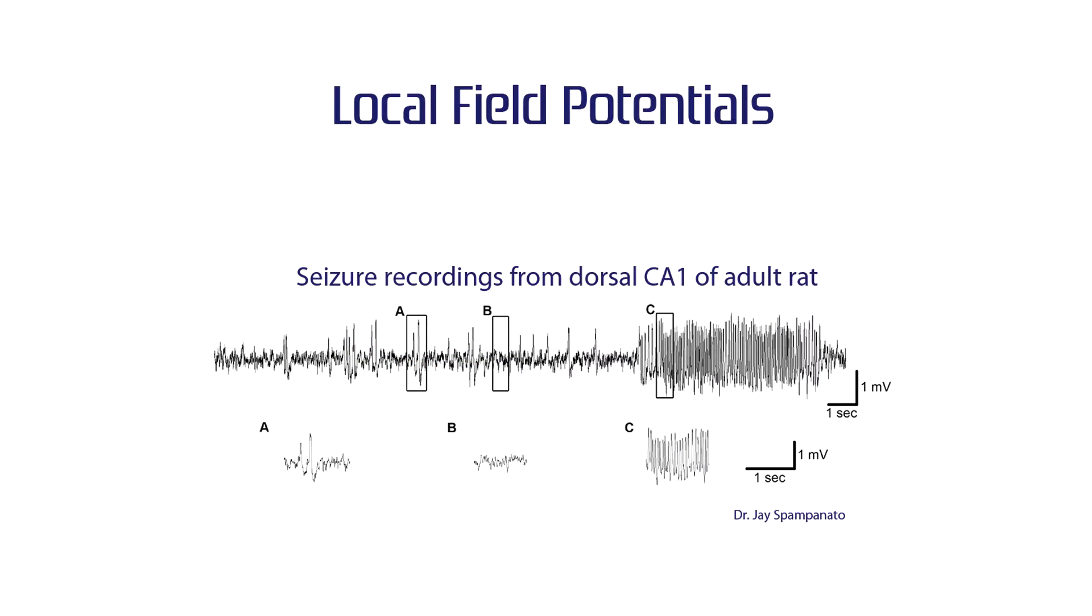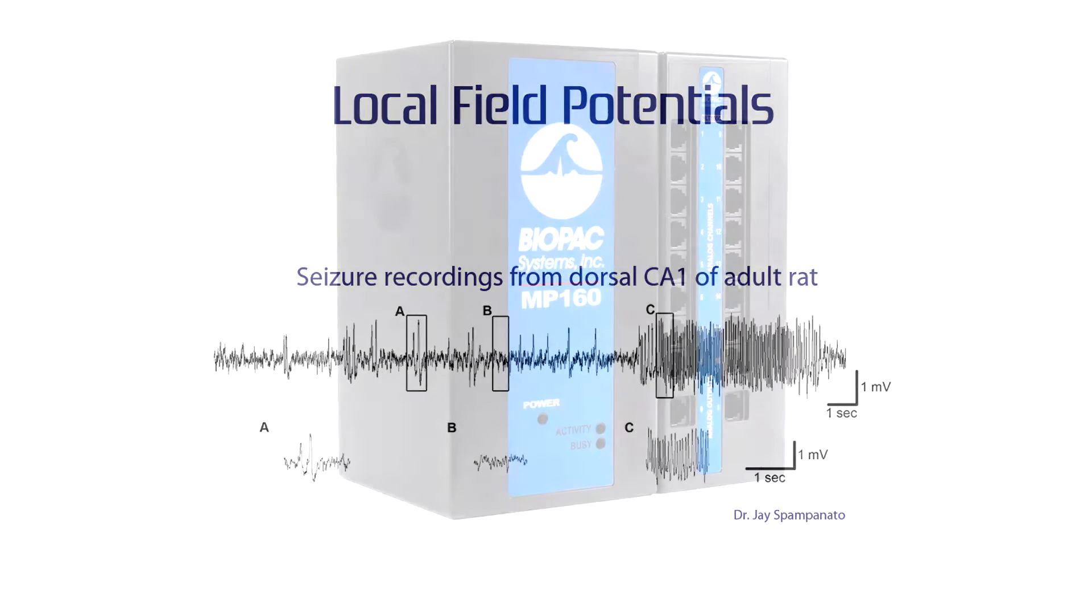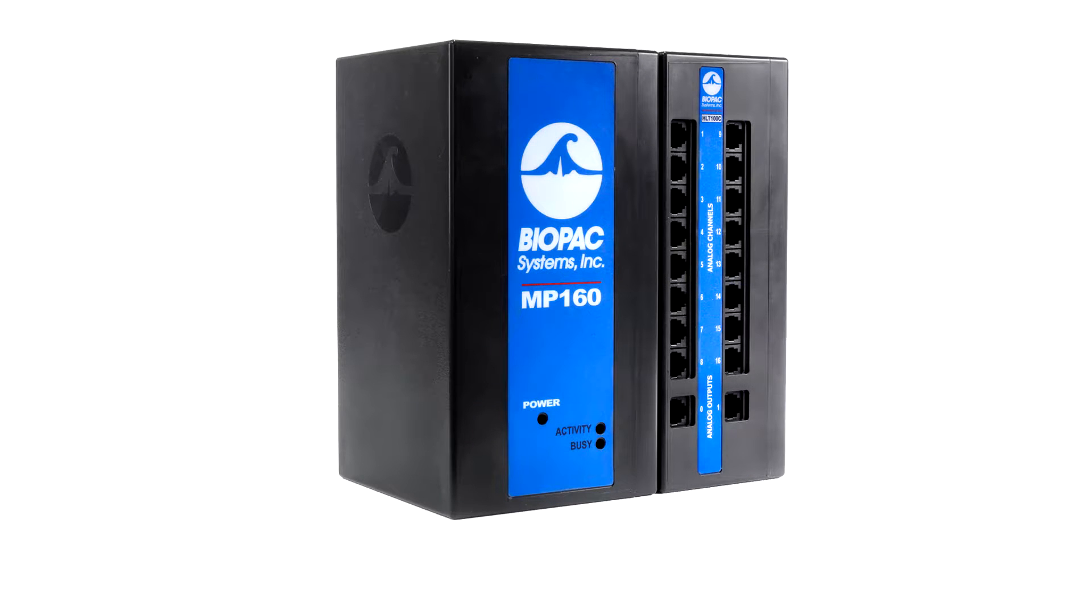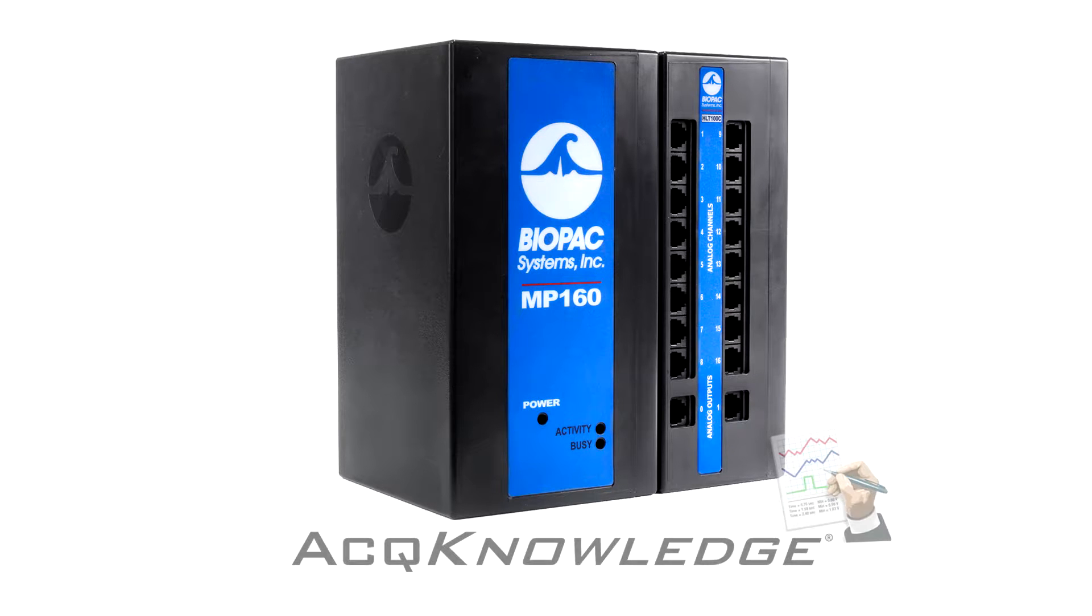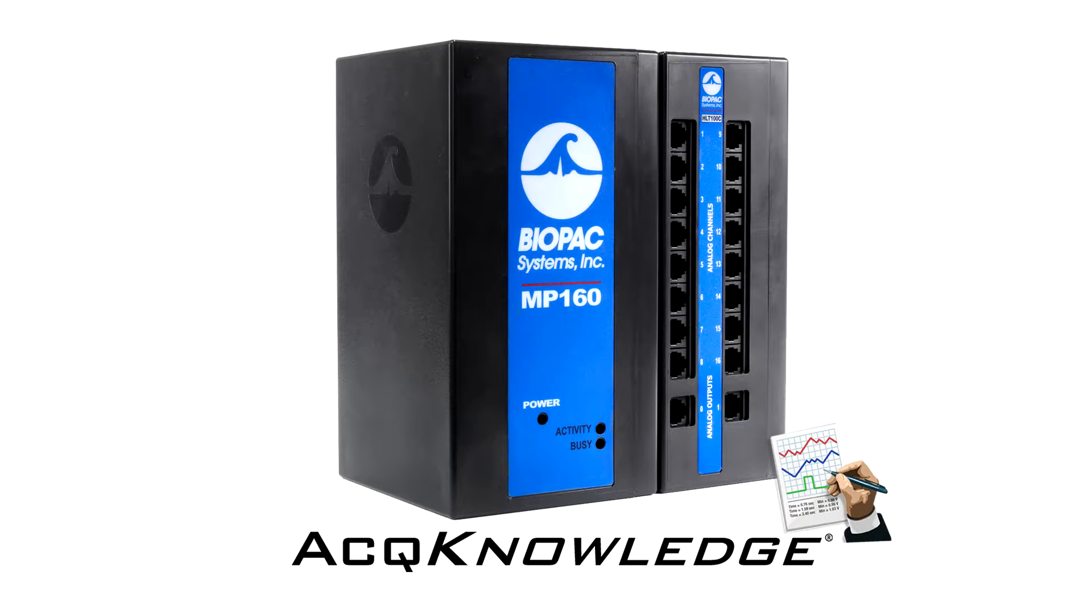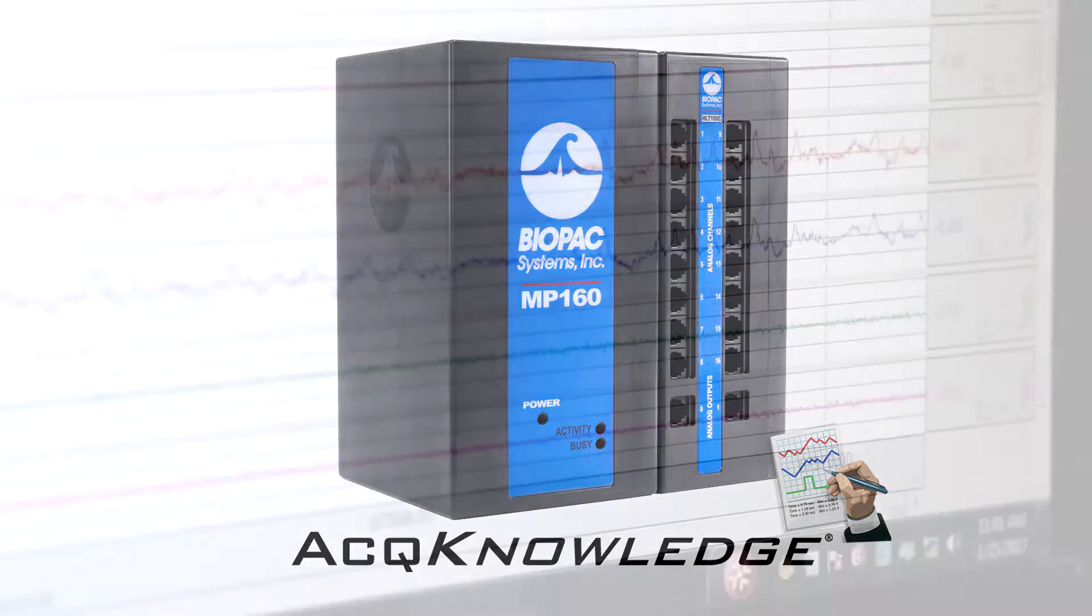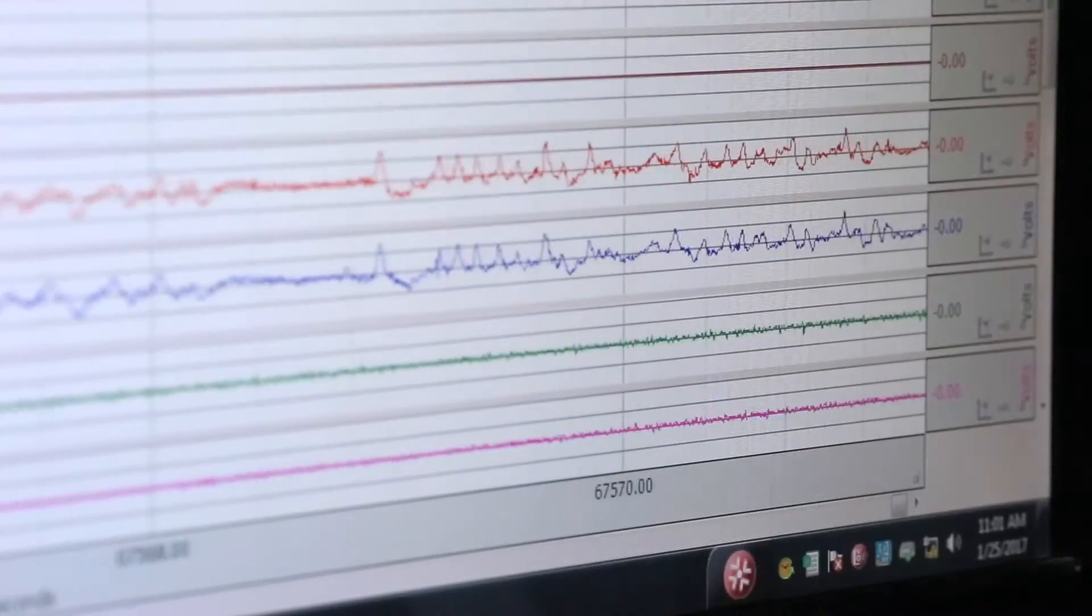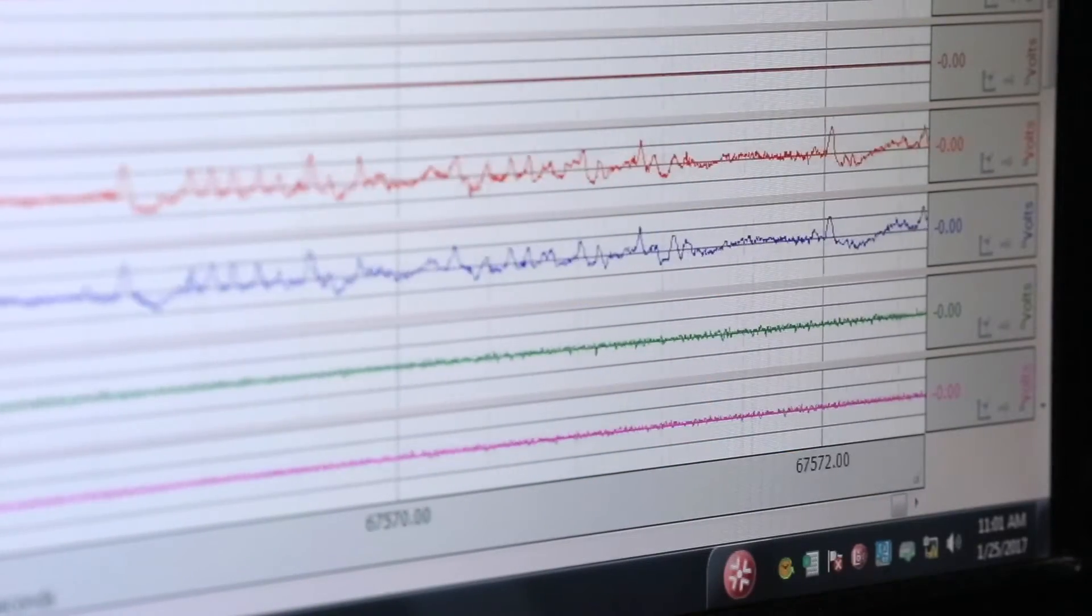EPIC enables local field potential recordings from deep brain structures. When paired with Biopac's MP research system, the power of Acknowledge software's automation and scoring tools can identify seizures, pre-define and control recording protocols, or set triggers based on external events.